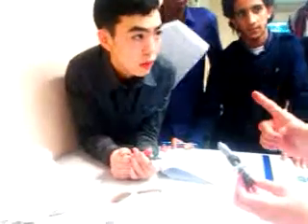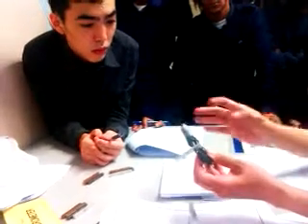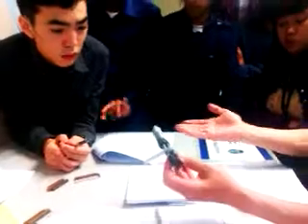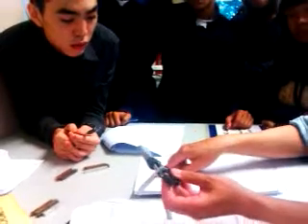If you're unsure whether the 6 line has appeared or almost appeared, or if the 0.5 line is exactly at the boundary and you don't know whether it's appeared or not — I'll teach you one technique. Check the 0 position: the 0 line position on the sub-scale. If the 0 is above the main field line, it means it's almost reached but hasn't reached yet.